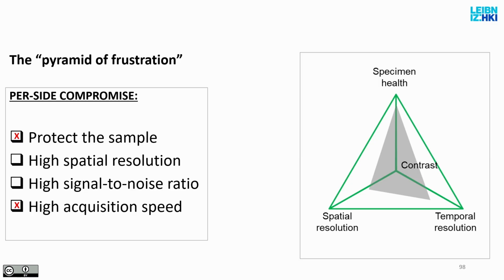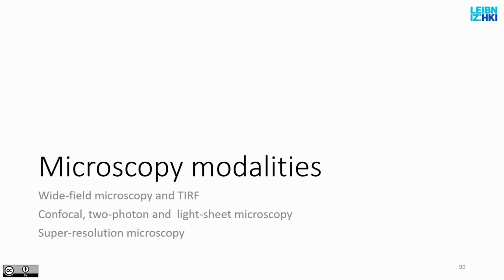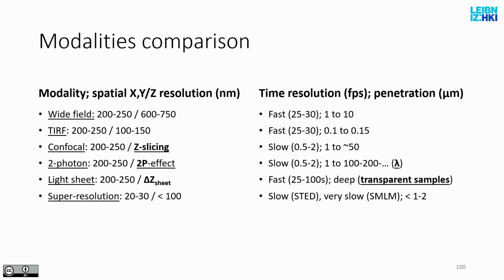Now, image analysis, also artificial intelligence-based image analysis, helps you a lot. So you have to remember that you set up your conditions as optimal as possible, but you don't have to be perfect. You cannot be perfect, but you don't have to be either. And this we will talk about later. Now, just a few slides to give you a little insight into how we can improve microscopy further.